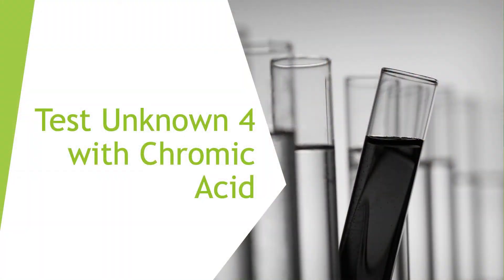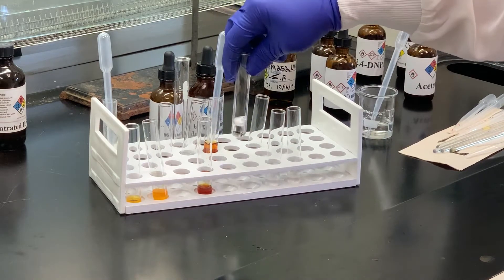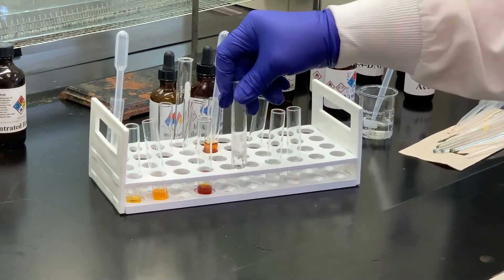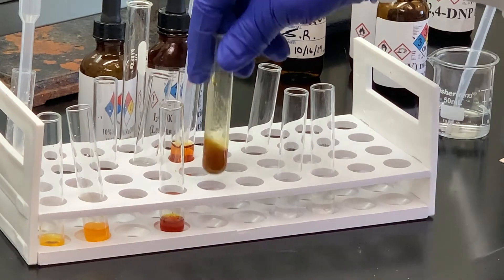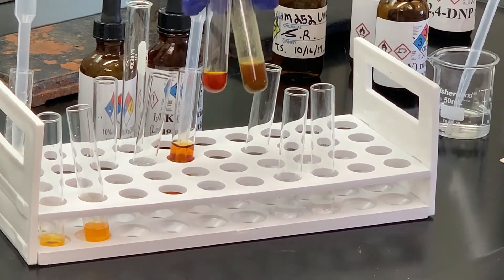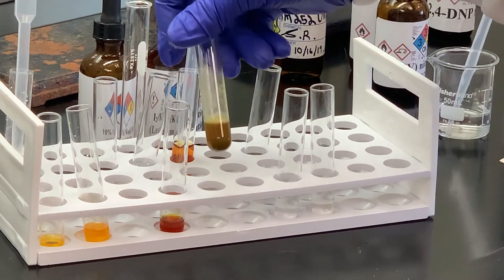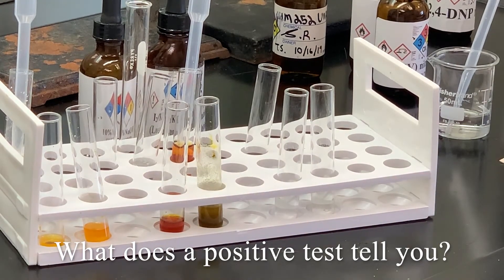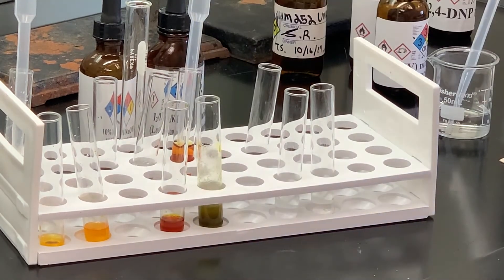After the ceric nitrate test, we're going to use the chromic acid. Here's my chromic acid solution, and I've got some acetone. I'm going to take some of my sample, add it to the acetone, swirl that to dissolve, and then add a couple drops of the chromic acid reagent. Notice that the orange color has disappeared and there is a greenish precipitate at the bottom. So the chromic acid test is positive, meaning we have something that can be oxidized.